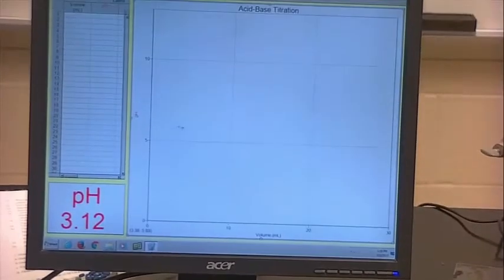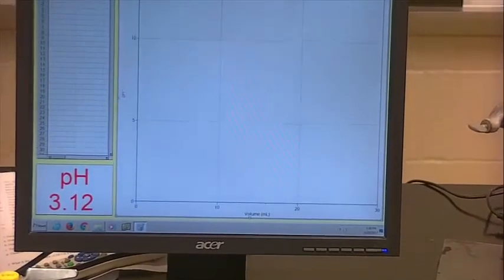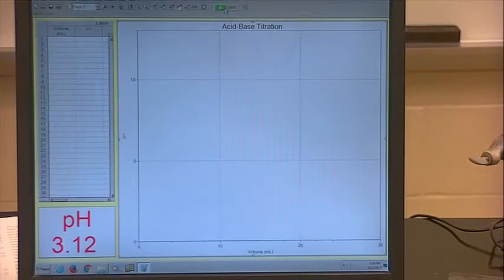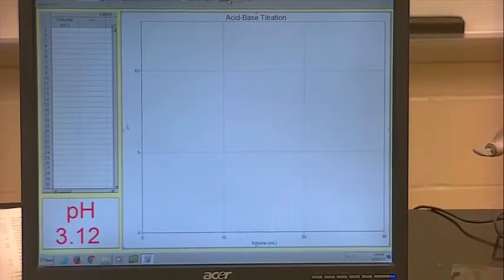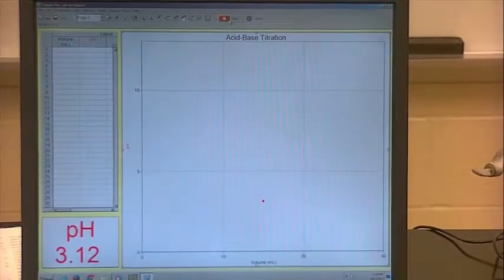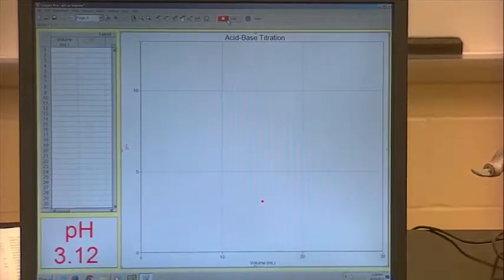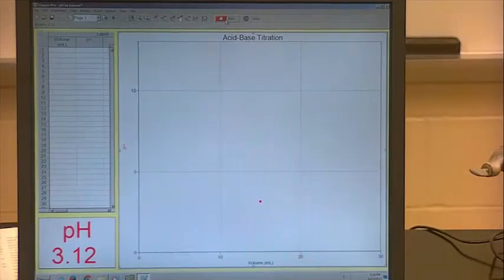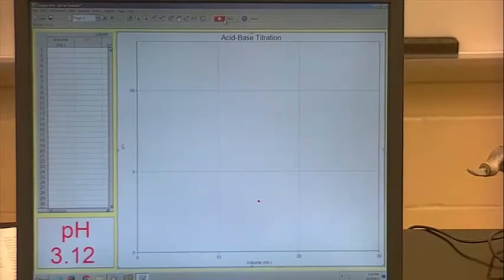What you want to do is you'll see a green collect button. Green collect button. That basically tells the computer I'm ready to collect. All right, so let's collect here. And there is our first point, but I haven't added anything yet. So that's okay, don't worry about that. Now I've added nothing. I'm going to begin to add, okay?